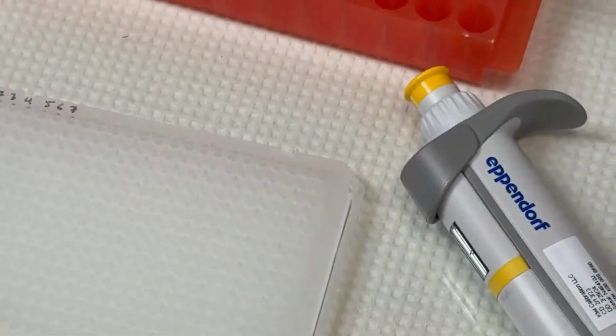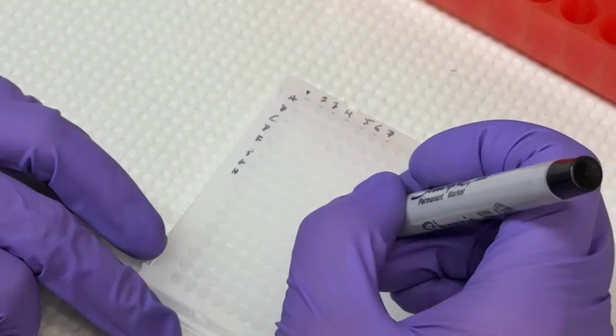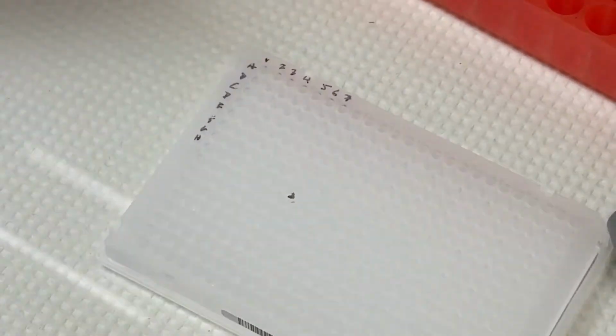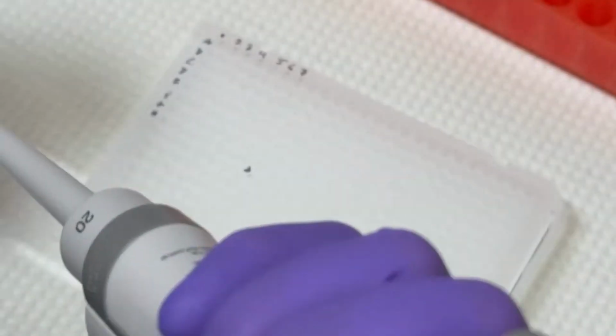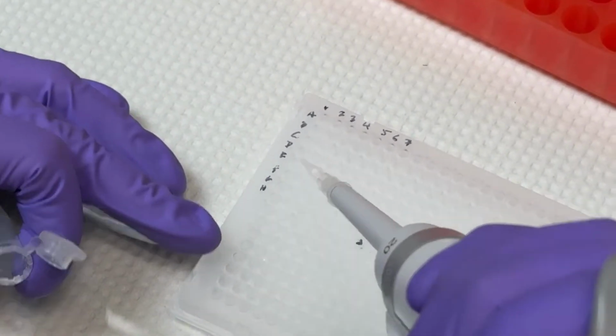All right. Hopefully that's a little better to see now. I'm even going to mark the edge here. Okay, so that's our field of view here. So we did A1 through 3, C1 through 3, E1 through 3 with our master mix.